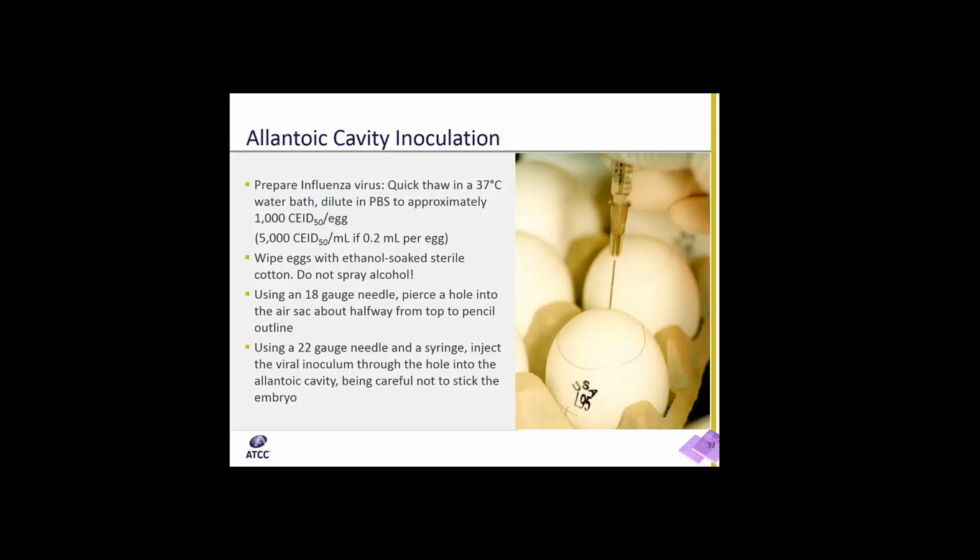Needles are a sharps hazard and should be rinsed with disinfectant such as 10% bleach and disposed in a biohazard sharps container. Do not recap needles.